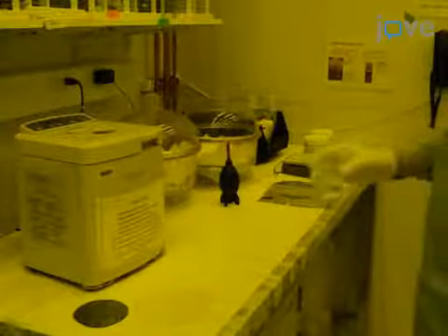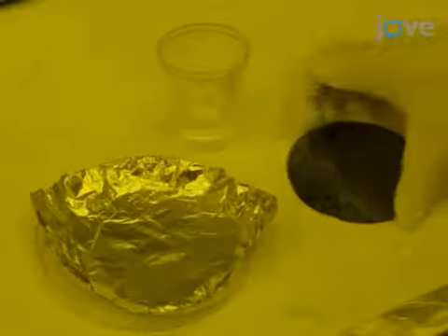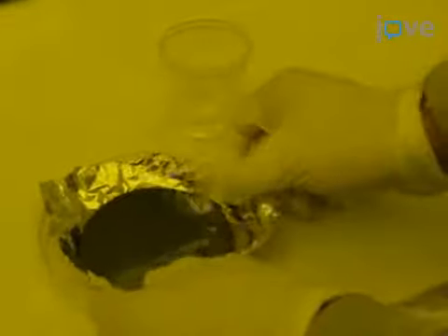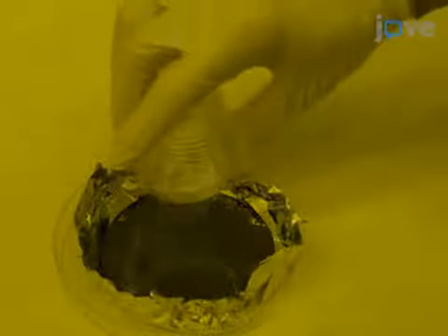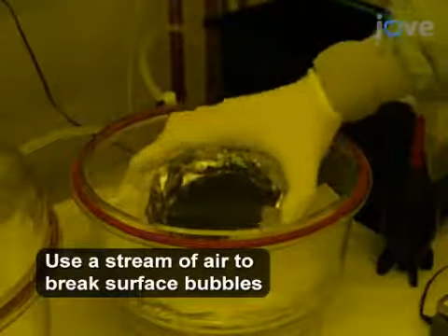After preparing PDMS polymer according to the text protocol, place a silicon master on a piece of unbroken aluminum foil in a polystyrene petri dish. Pour the degassed PDMS mixture over the master to a depth of approximately 5 millimeters, then degas the dish for at least 10 minutes.